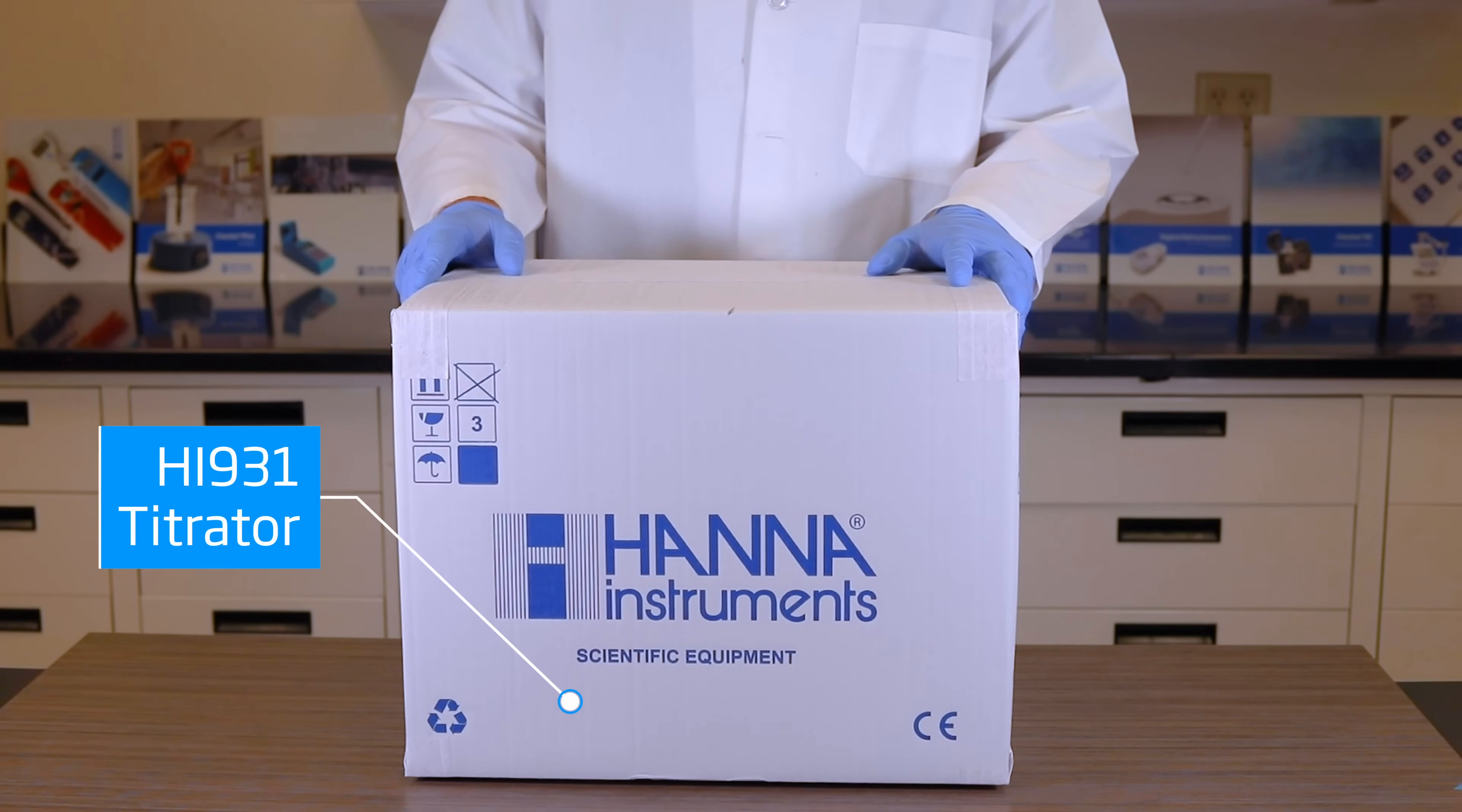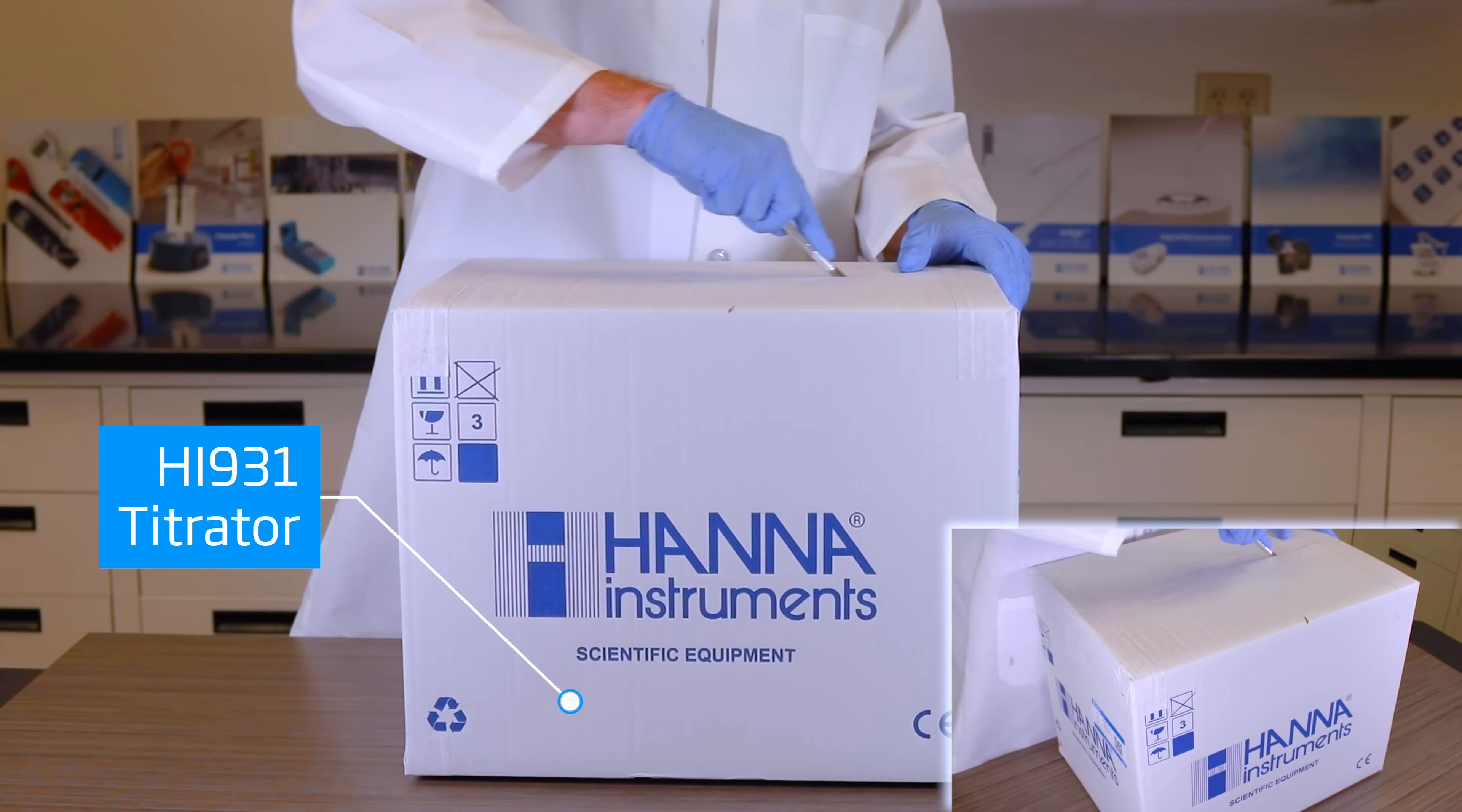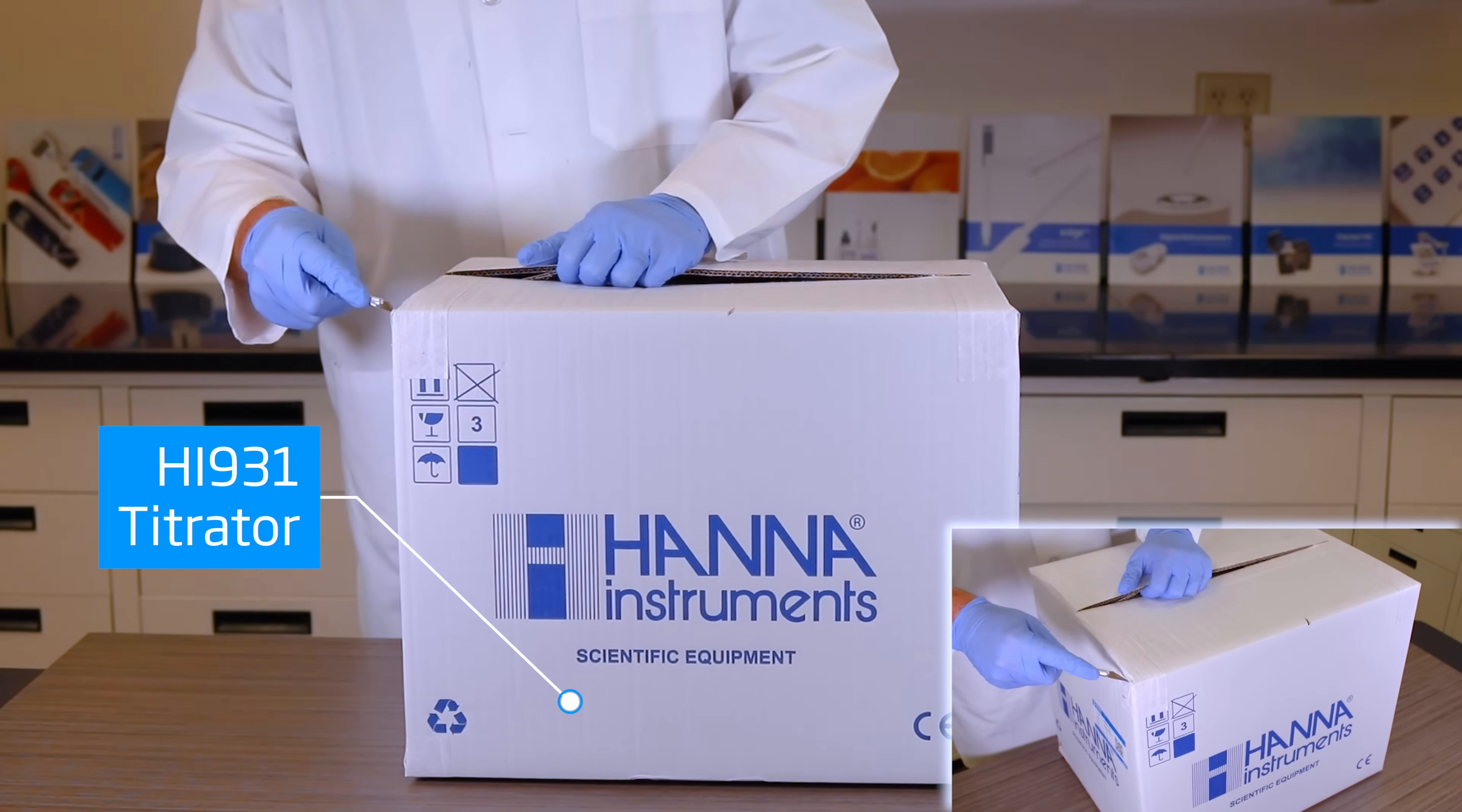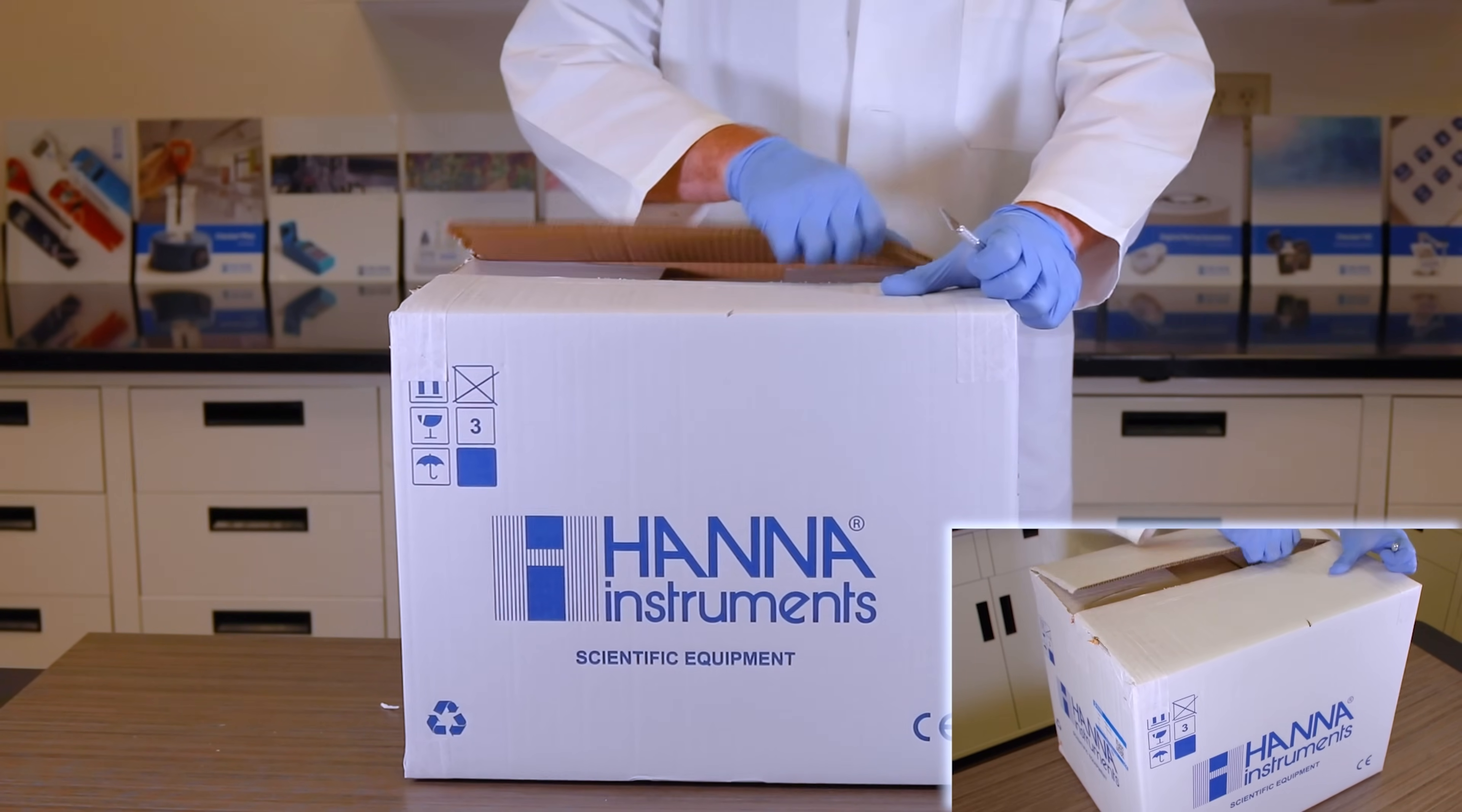In this video, we will be showing you how to install your new Hanna Instruments Automatic Potentiometric Titrator. Your titrator will arrive in a Hanna Instruments branded box.